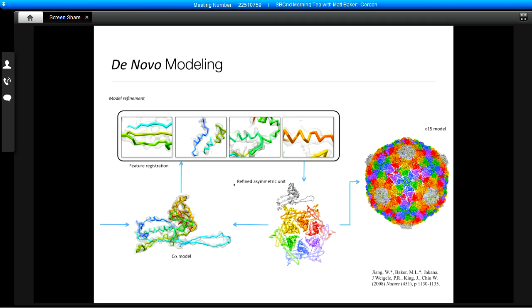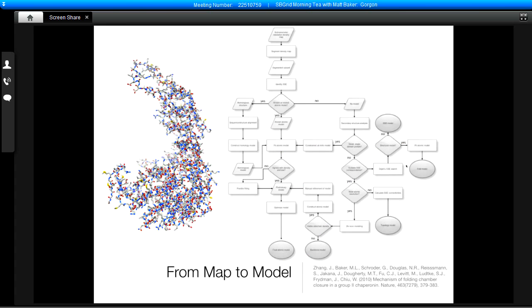One of the tools from SSE Hunter was this density skeleton, which gave us topological information on which secondary structure elements were connected to each other. Using this, we could build by hand a model for the fold of our structure and how secondary structure elements were connected. Once we had that level of information, we could develop a basic chain trace, go through the density, find alpha helices and beta sheets, improve the structure for geometry, look for large bulky side chains to anchor the trace, and iterate through C-alpha model building and refinement to develop a final model.